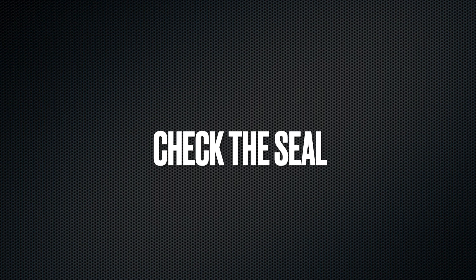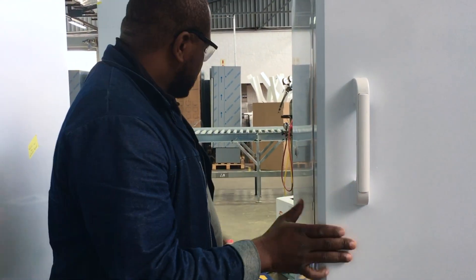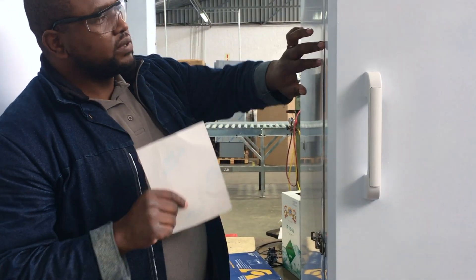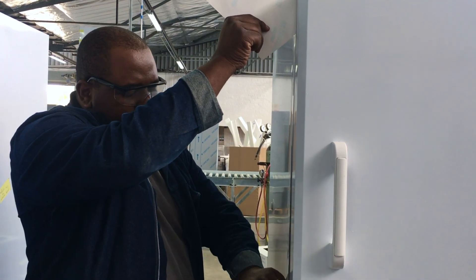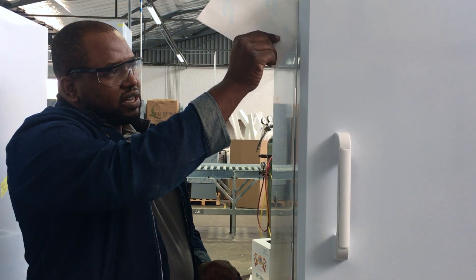Close the door and check the quality of the door seal. To do this, you need to use a piece of paper. Open the door, stick the piece of paper in the seal, and close the door. If you're struggling to slide the paper out, the quality of the seal is fine. If it slides out easily, it means your door seal is not correct.